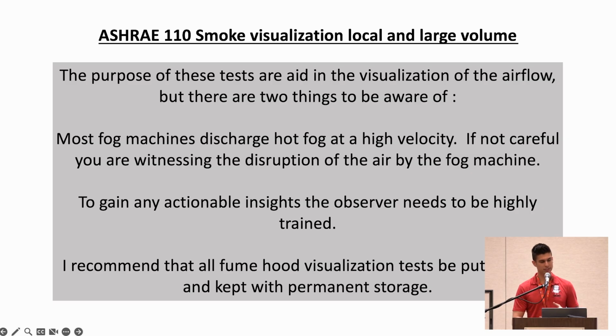But I would like to show you and tell you about, well, really quickly, the purpose of these tests obviously is to aid in the visualization. Big word for me. It's a powerful one that I want you to remember. We need to visualize this stuff. The data is good, the numbers are great, but smoke tests aid in visualization. So fog emissions are also hot. That produces a thermal issue as well, the high velocity. But to really get what you're looking for in small and local smoke, you have to have those right pieces of equipment, or else you're not getting an accurate depiction.